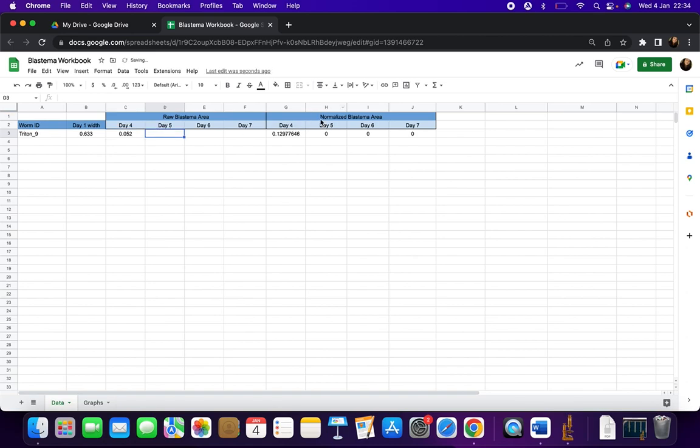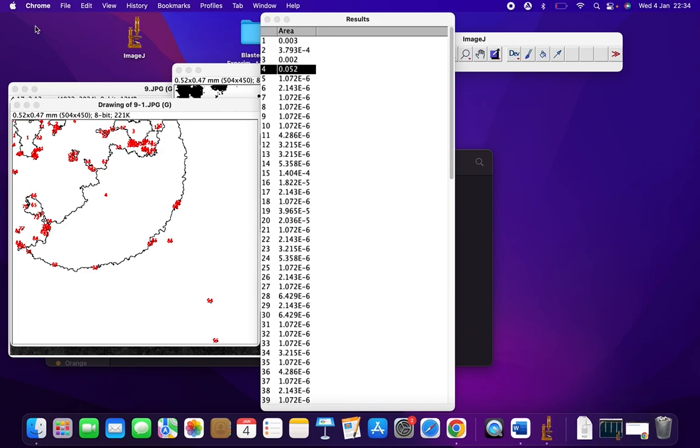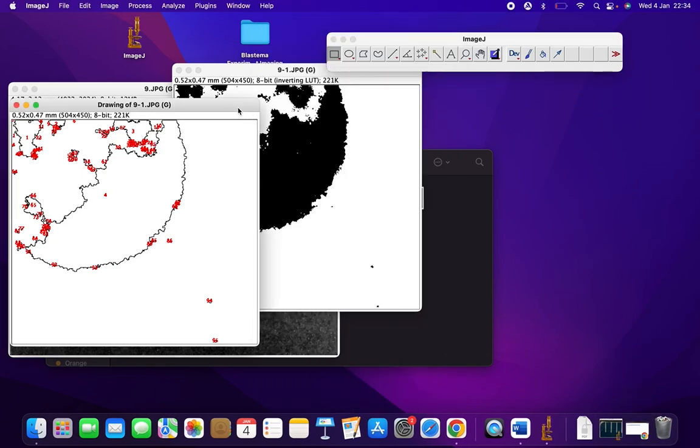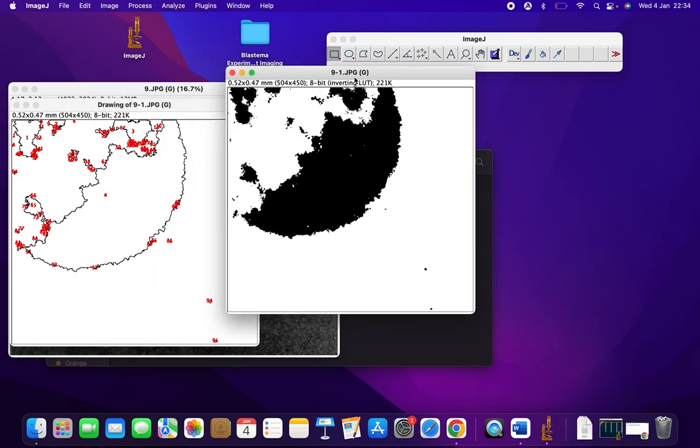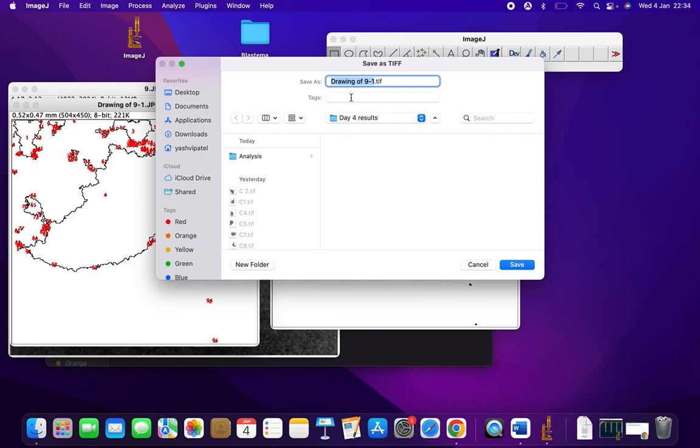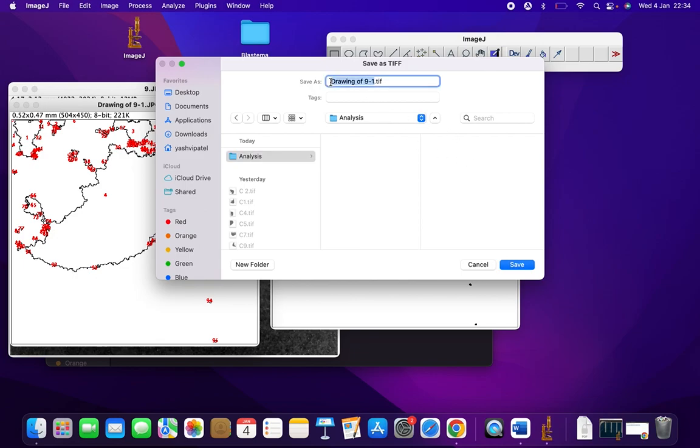From here we can minimize this and close Results, but we do want to save the outlines and the threshold image for future reference. Just press Command+S and save them in a folder for analysis, labeling them appropriately such as outline and threshold.